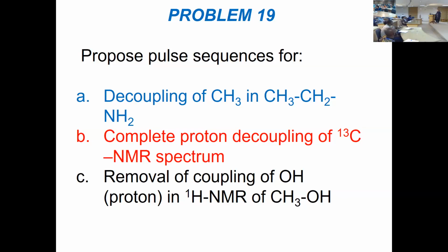With the increasing number of experiments, signals overlap and you get very sharp, intense peaks, while your baseline gets thinner and thinner. This is what signal to noise ratio is. The signals are overlapping and the noises are random, so they just cancel out each other.